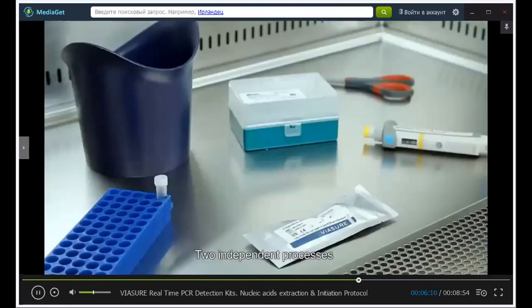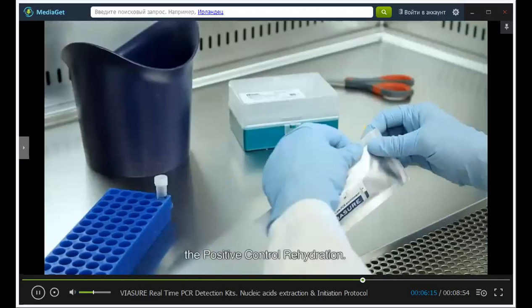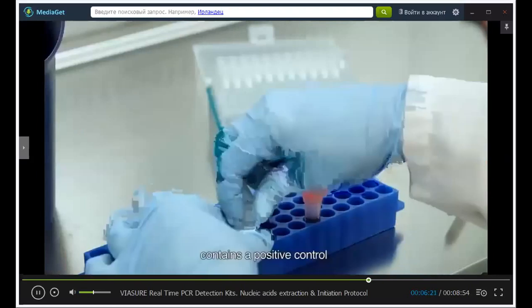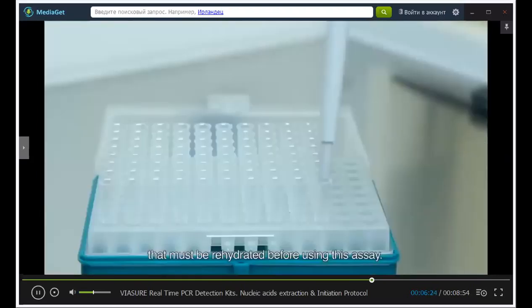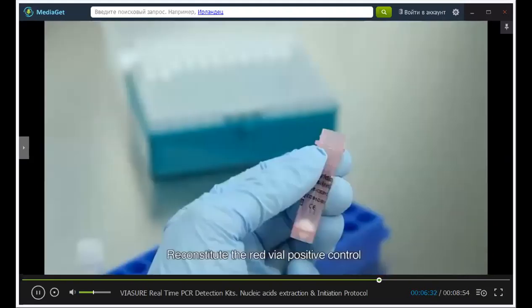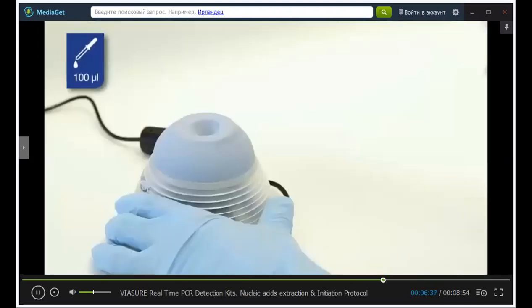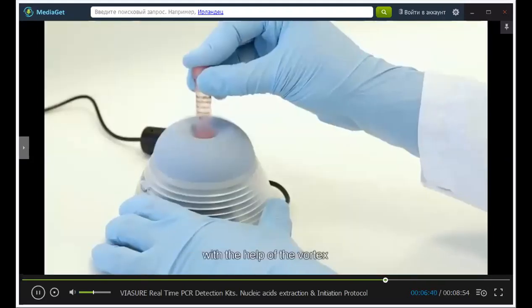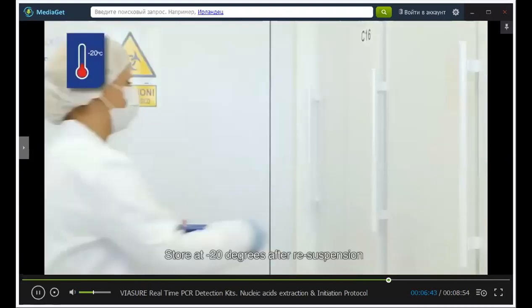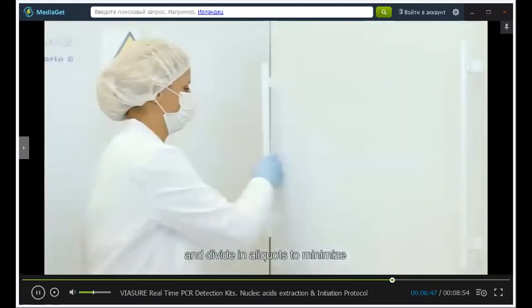Two independent processes are made in the third area. First, the positive control rehydration. ViaSure pathogen real-time PCR detection kit contains a positive control that must be rehydrated before using in this assay. It is recommended to open and manipulate it before starting with the assay. Reconstitute the red vial positive control with 100 microliters of the white vial RNase-free, DNase-free water and mix with the help of the vortex. Store at -20 degrees after resuspension and divide in aliquots to minimize the freeze-thaw cycles.